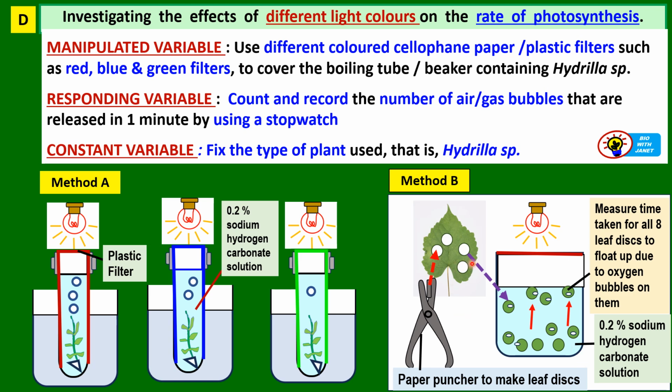First of all, they get the leaf disc from a leaf. Okay, from a normal leaf, from plants, and they punch the hole to make the small leaf disc. Okay, and then they have a method to expel the excess air from the leaf spaces, in the intercellular spaces in the leaf.